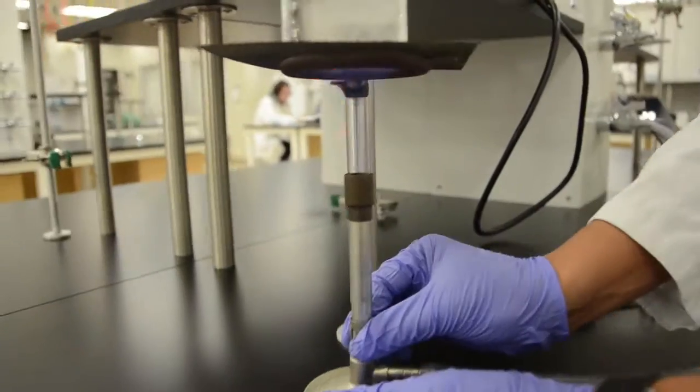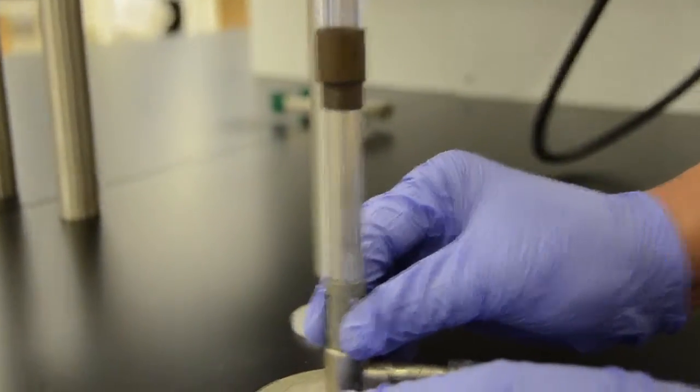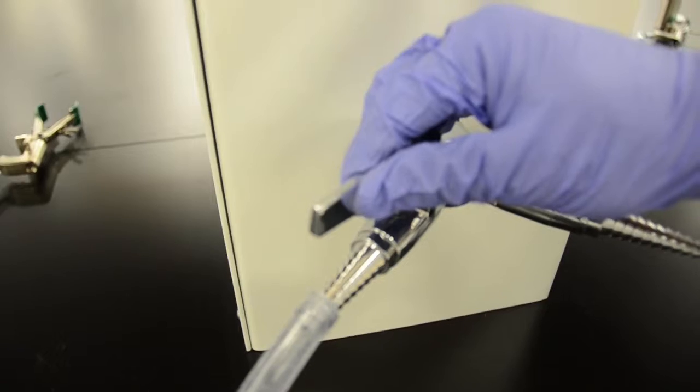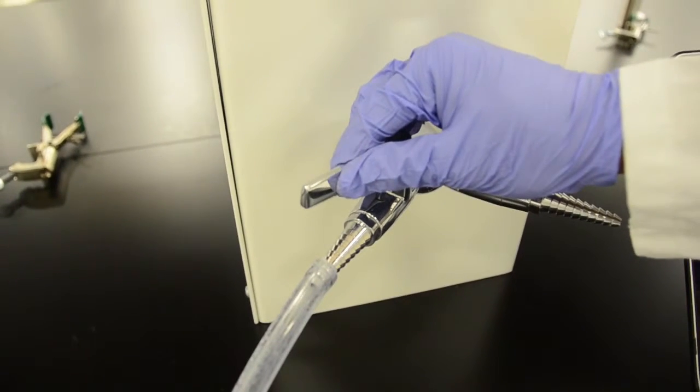After the flame is lit, you can adjust the opening on the Bunsen burner in order to adjust the height of the flame. Or, you can simply decrease the amount of gas flowing by turning the gas valve slightly towards the closed position.